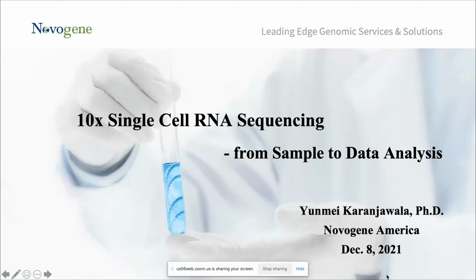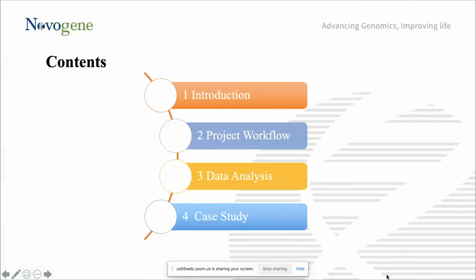Hi, everyone. Welcome to this webinar section, 10x single-cell RNA sequencing from sample to data analysis. My name is Yun Mei, and I work in the tech support team at Novogene. This presentation contains 4 parts: introduction, project workflow, data analysis overview, and a brief case study.